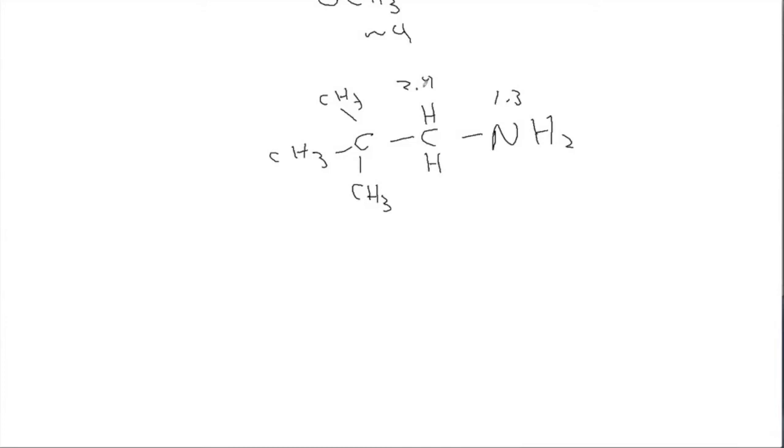The 2.4 peak is a singlet. Does that match your picture? Yes, it does, because there's no hydrogens here. And remember, amine hydrogens don't do splitting. So this is adjacent to no hydrogens that can split them. That is consistent with our picture here.